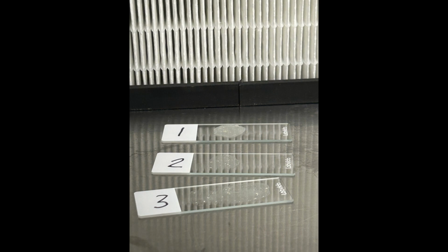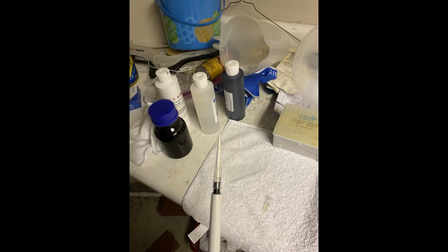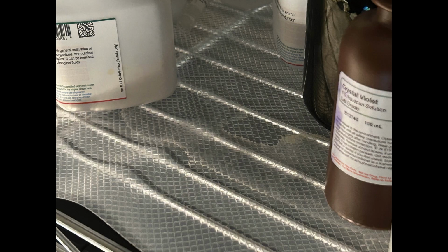To start the gram stains, I first needed to fix the bacteria to a microscope slide. Two popular ways of doing this are heat fixation and methanol fixation, which one requires methanol. In the past, I got a bottle of heet antifreeze from the gas station and put that in my freezer, and used that whenever necessary. But I found out the hard way that the bottle they use for it leaks, even when upright, so I haven't bought any since, and for that reason, I chose the safer alternative, heat fixation.